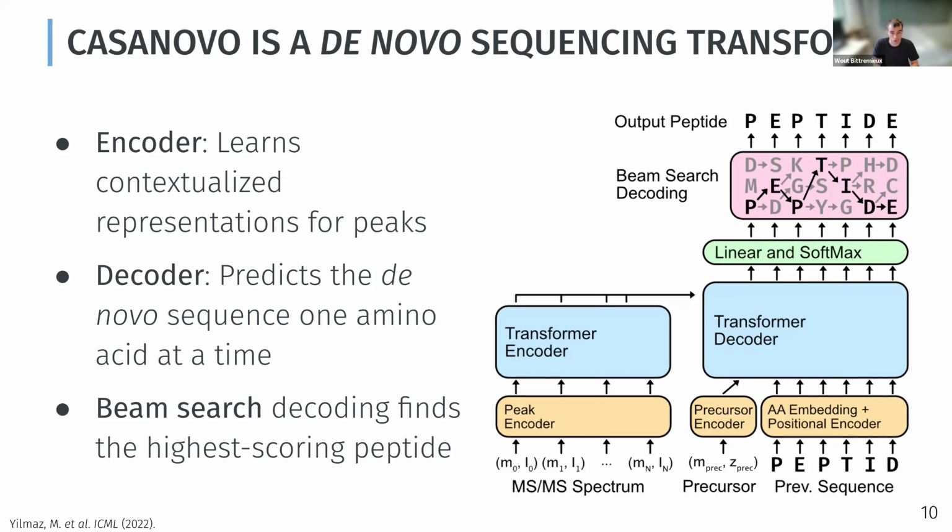binning approaches and convolutional neural networks, where in contrast in the transformer, we just provide the exact mass and intensity value directly to the peak encoder, which then uses the sinusoidal encodings to represent these values. So we provide the masses at their native resolution to the model. So we avoid these artifacts due to binning.